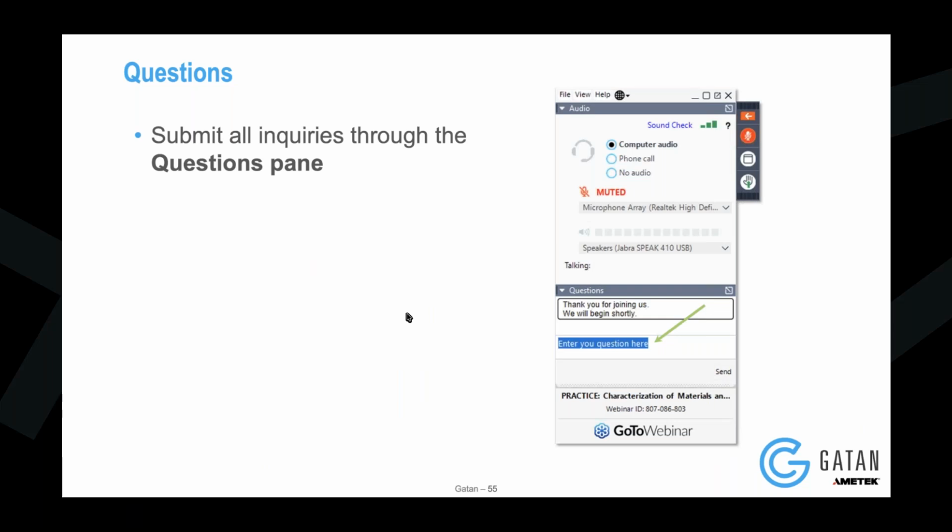But in general, also for iterative ptychography itself, there are different advantages to different methods. We want to try and converge something as physically realistic as possible. And I mentioned in the presentation earlier, these ML-based techniques that we have in Quantium specifically are a way of improving resolution and depth sensitivity. The base algorithm that I explained is the same, but depending on the exact reconstruction method and your sample, you might get slightly different results.